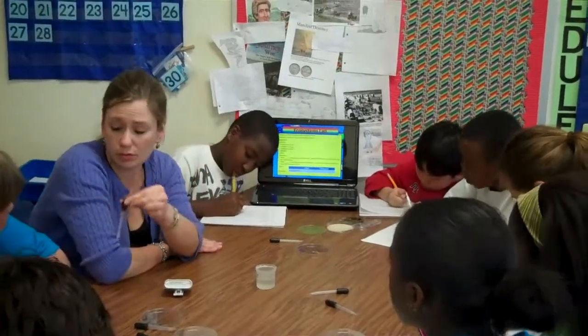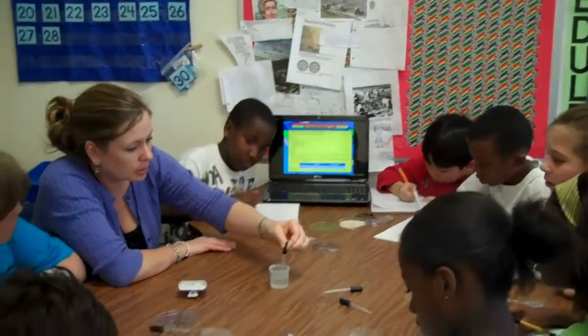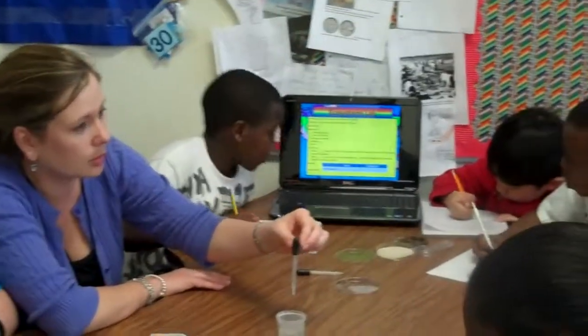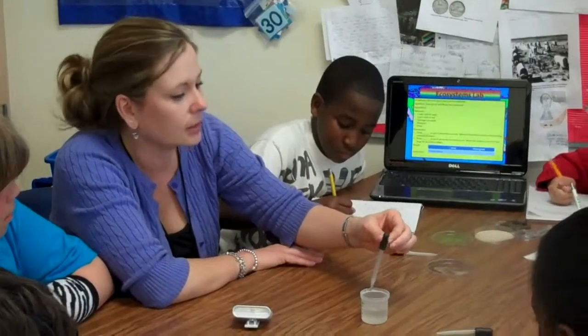And then for those of you who've never used a dropper before, you squeeze, you put it in, let go, and it sucks it up. But when we worked on this yesterday with another group, a lot of people didn't know how to do it. So you squeeze, put it in, suck up. Exactly.